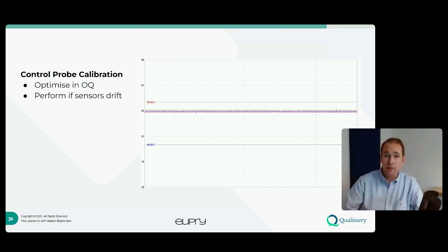So this is where the periodic review that I talked about earlier on comes in, analyzing those temperature mapping data. Yes, this has passed. So you've ticked your box. You've said we've passed, but it's not controlling right in the center of the temperature band. It might have drifted since the last qualification. It might have slightly increased.